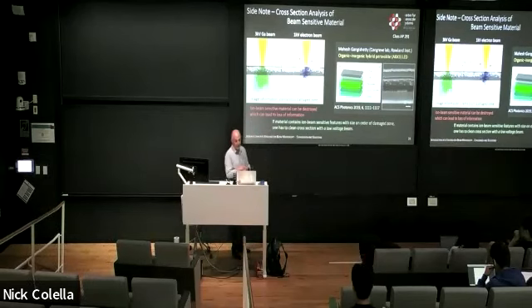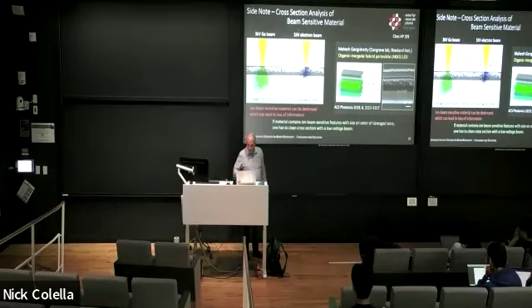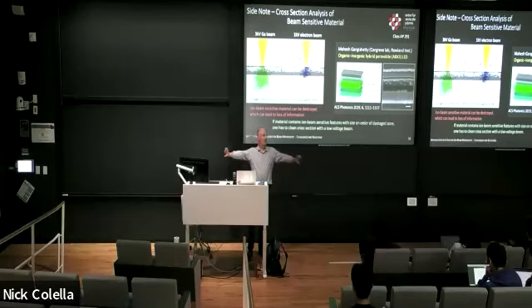Like in this case, this was an organic-inorganic hybrid perovskite system. We knew from crystallography, from X-ray diffraction, that these tiny nanoparticles that you see here on the left side were crystalline. And our initial imaging was just producing a homogeneous band with no structure inside, because the gallium interaction completely obliterated those little crystallites.